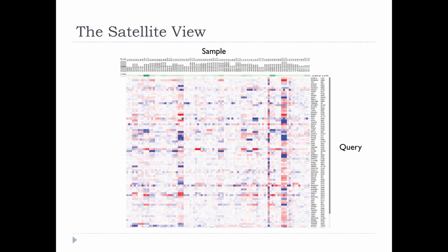But I'm going to say that there's a lot more that might have gone on underneath there, and if you just rush to this, then you're in danger of believing it even when you shouldn't.